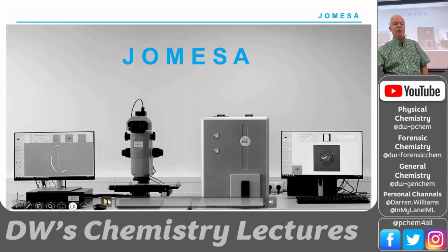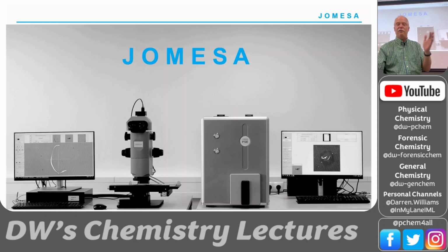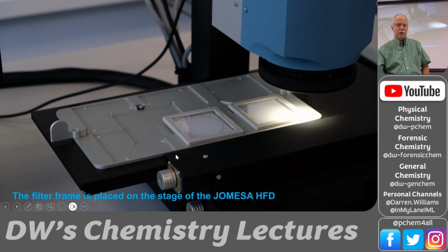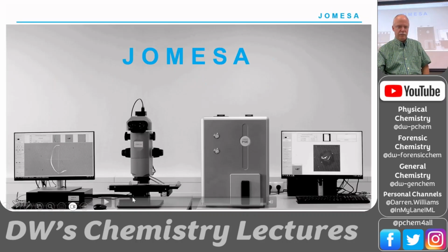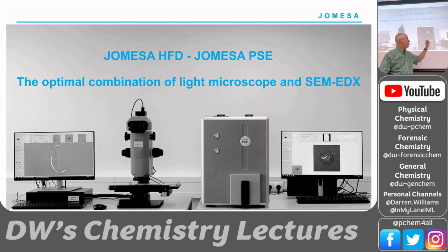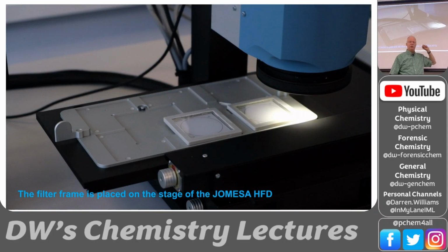And so they've automated this because you can imagine on an assembly line where they're making these parts, I don't know how frequently, but 100 a month or 1,000 a month, they need to automate this process. Okay, let's go. Where's the video? So on the left is an optical microscope, and on the right is a scanning electron microscope.